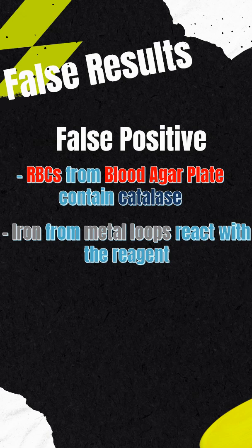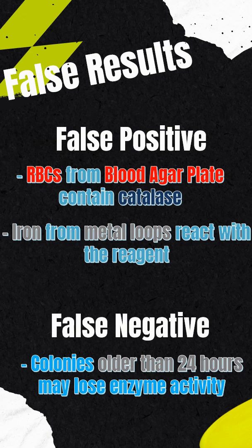Instead, use a plastic loop or transfer the colony before adding the reagent. For false negatives, make sure that your colony is fresh — older than 24 hours might lose their catalase activity.